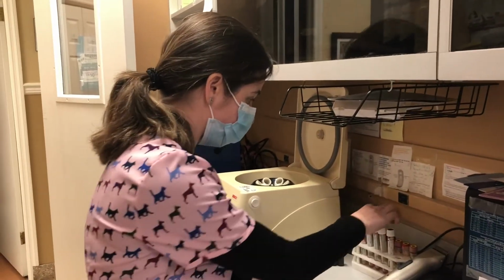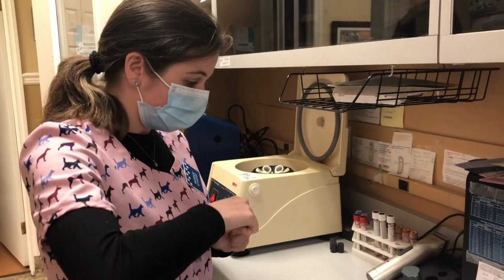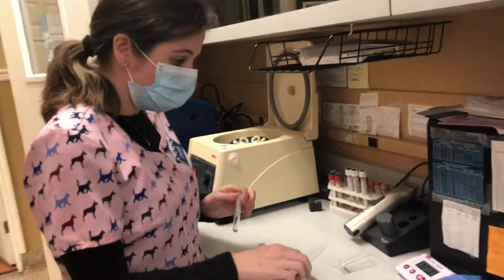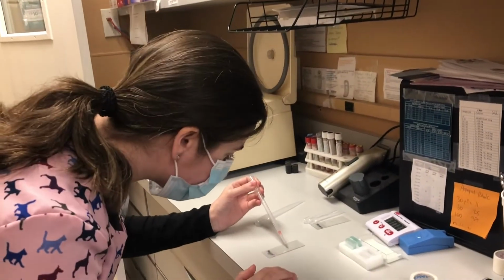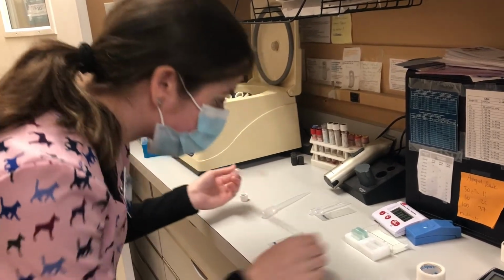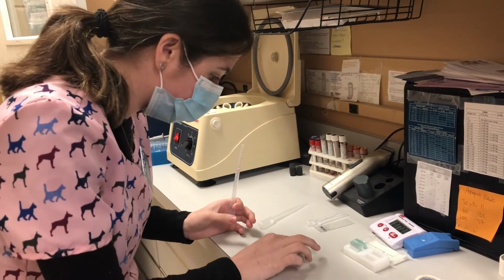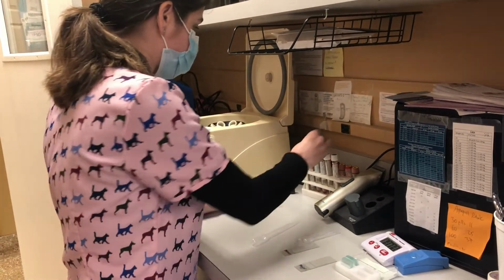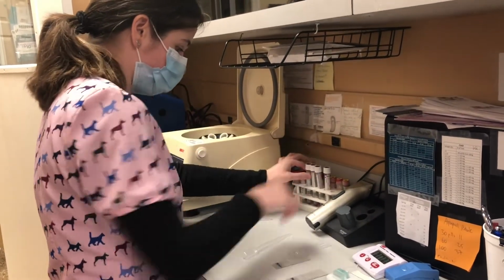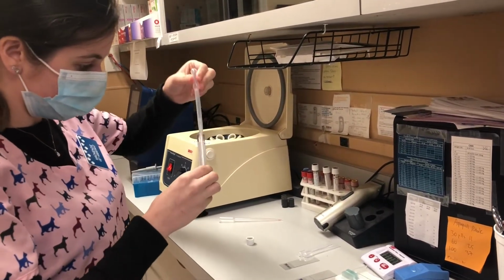So what I'll do is I'll start with my major, take a drop, and put it onto my microscope slide with a cover slip, and we'll take a look under the microscope. And then I'll take my minor as well, and then we'll bring it over to the microscope.